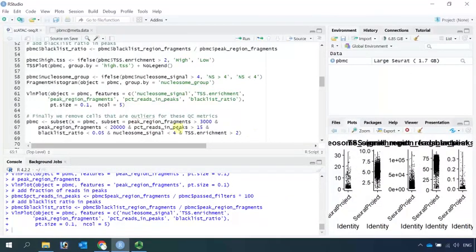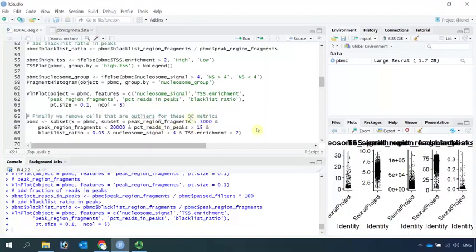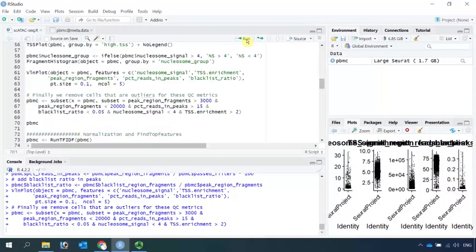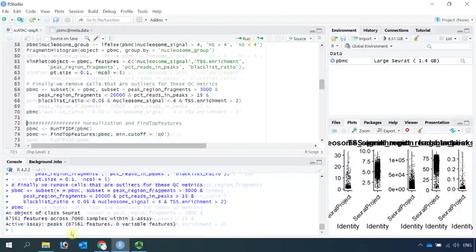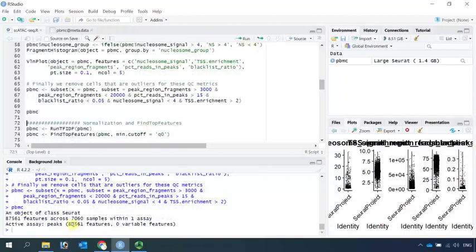This is the code I copied from the online tutorial. We can use this quality control matrix to remove cells that are outliers. We performed the quality control. If we have a look at the PBMC object again, you can see now we only have 7,060 cells. We filtered out the low-quality cells.